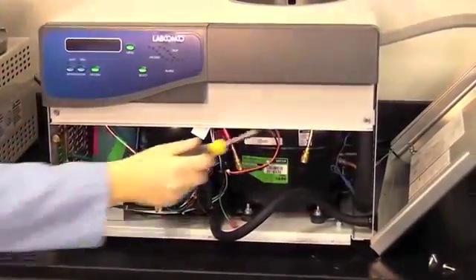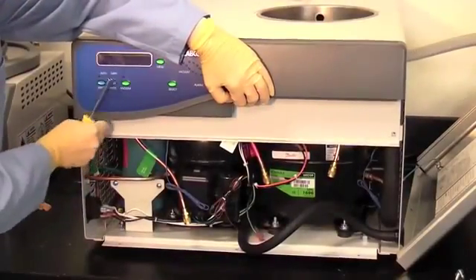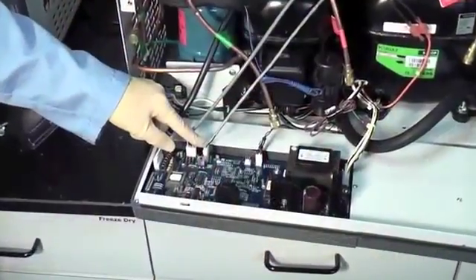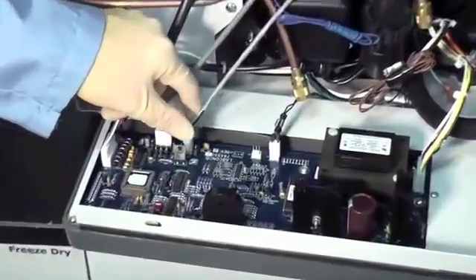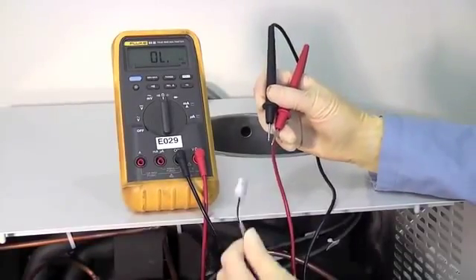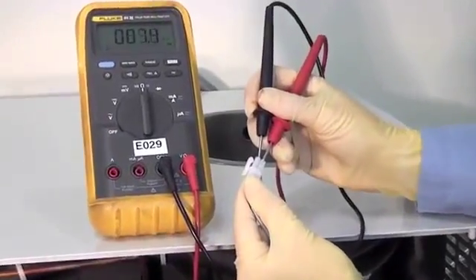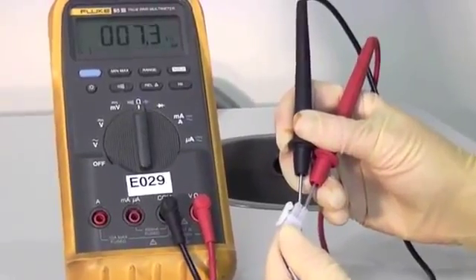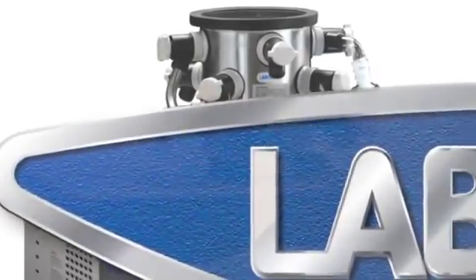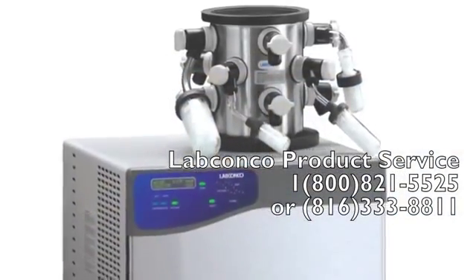Lower the control panel and unplug the vacuum sensor. Check the vacuum sensor using a multimeter and verify the resistance is between 6.5 and 9.5 kilo-ohms. If these steps do not stop the vacuum leak, please call LabConco Product Service at 800-821-5525.